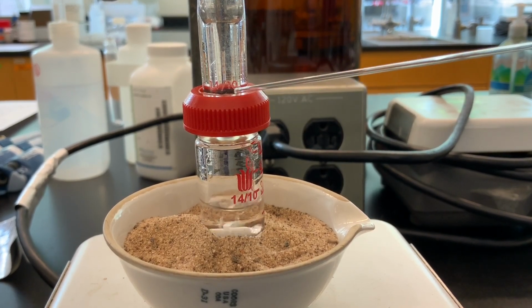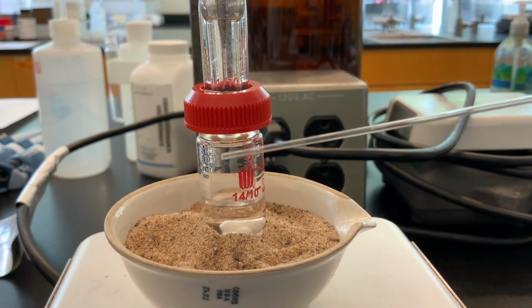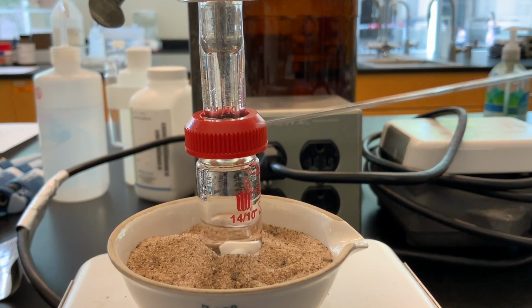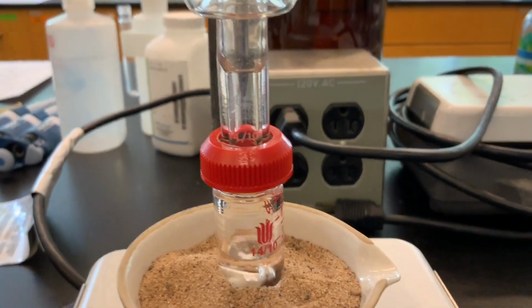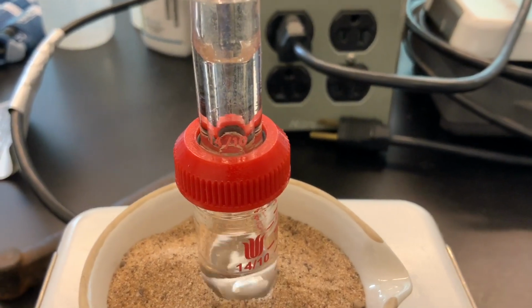And we can already start to see now at the juncture between the 5 milliliter reaction vial and the Hickman-Hinkle stillhead, if we peer down in here, we might be able to see that those vapors are doing exactly that.